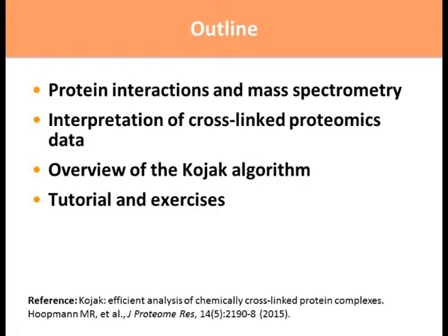And again, the outline for today is I'm going to go over briefly protein interactions and how they are measured in a mass spectrometer. I'm going to tell you how cross-linked proteomics data is interpreted, give you an overview of the Kojak algorithm, and then the tutorials and exercises are included in this, and that we'll get to use Kojak, just not today.